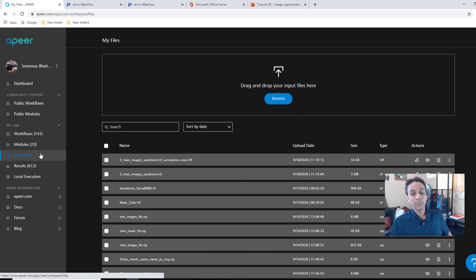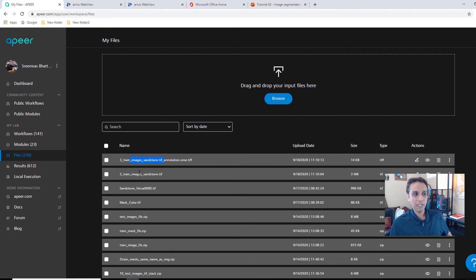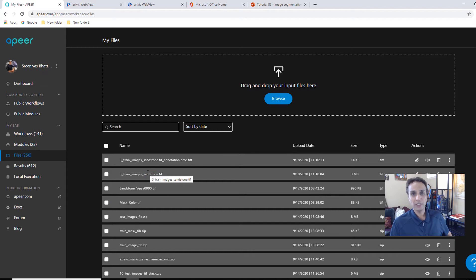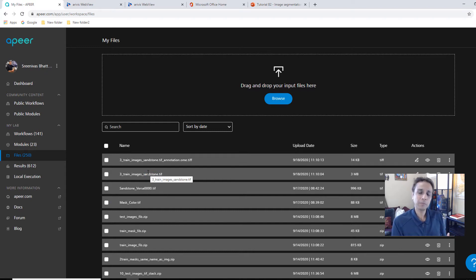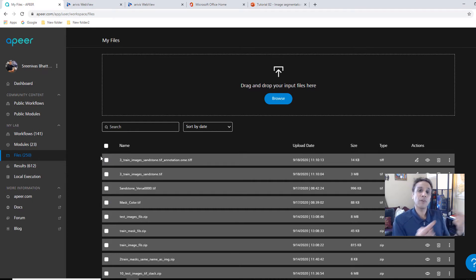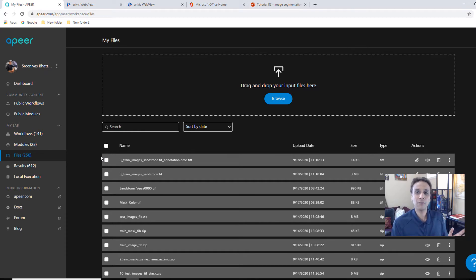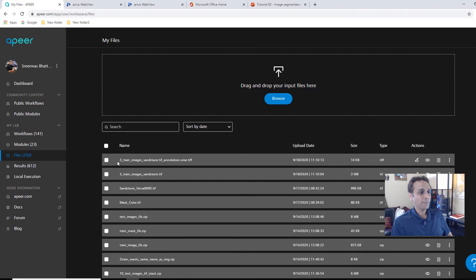This is my modules. And again, creating a module is simple. You just pick a template like Python template, and then it creates a cookie cutter template and you can edit the code and you can create. And there is a process. For example, if I click on my module right there, it tells me, first copy the code to local drive, then do this, then do this. So we try to make it as easy as possible. But if you have questions, always contact us in terms of how to create these modules. Next step files, you can save up to a hundred gigs of storage.